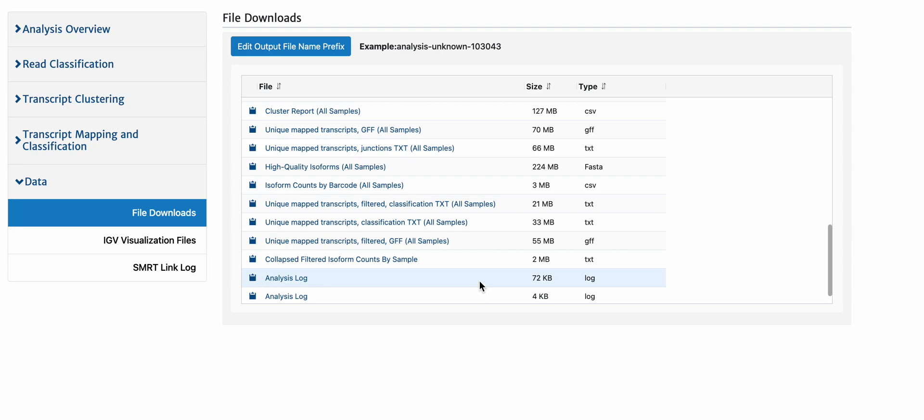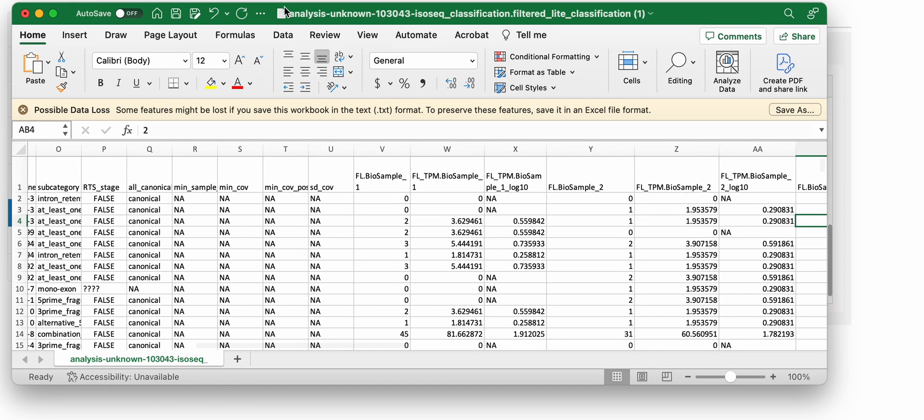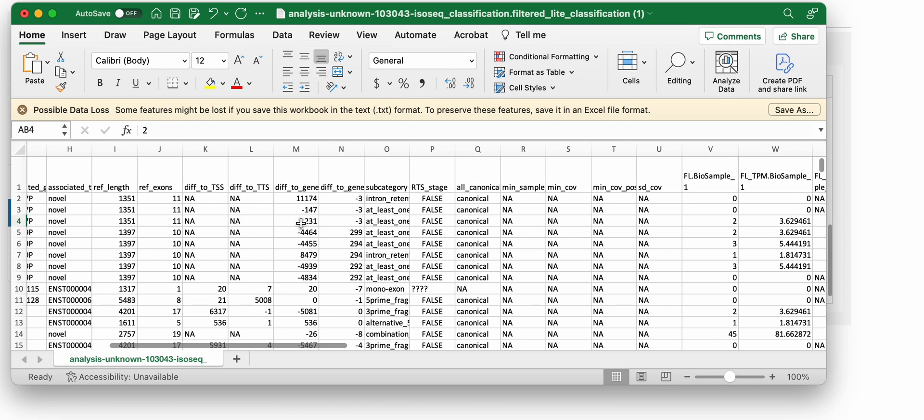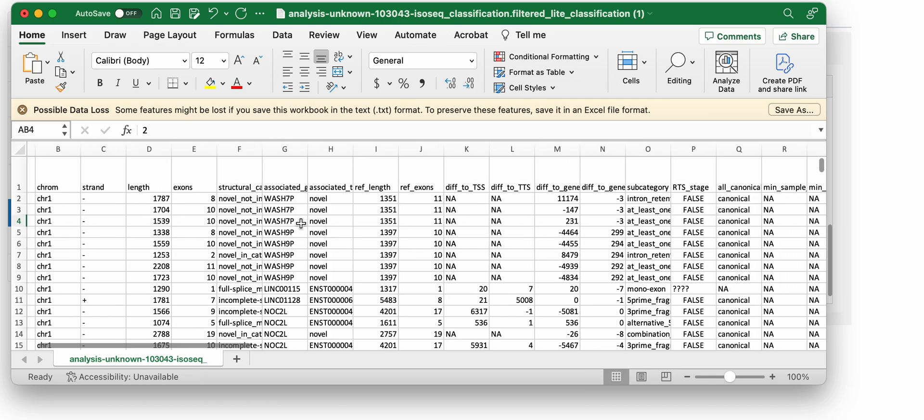If we now go and download this file that says unique map transcripts filter classification text file, let's open that up.